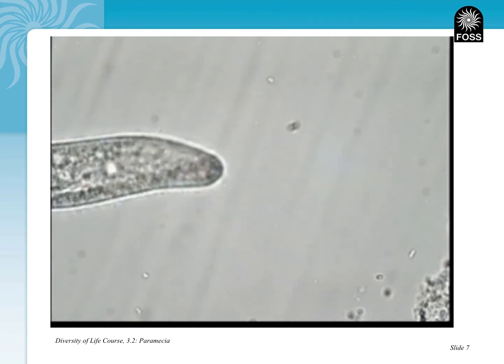Pretty cool. Notice how they were spinning around, and if you look closely, you can see there's a lot of other cellular structures inside of those cells, much like maybe what you saw within the Elodea cells. Got a couple more little videos to show you. It should be really cool to look at these paramecium.